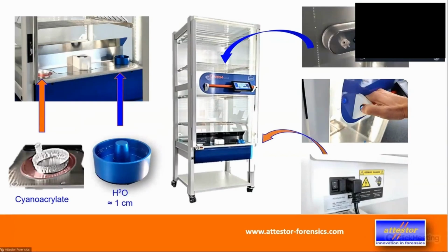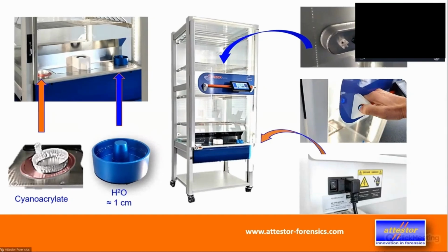That black thing on the right of the white knob is a socket for our UVC unit, covered, and when you use it, you just unscrew it and plug in your UVC unit. By the way, our UVC units are identical whether you use them in an anhydrous chamber or in this one. It's the same thing. You can just alternate it between the two systems you have.